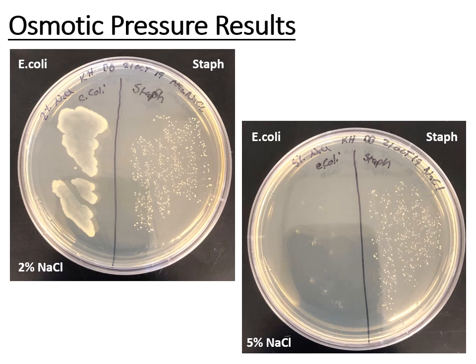You then have osmotic pressure results. So these are salt plates. You'll notice that this first plate on the left is 2% salt versus this plate on the right, which is 5% salt. Both of these plates are the same except this one has more salt in it, and both of them were streaked with the same bacteria: E. coli on the left side here versus staph on the right side here.